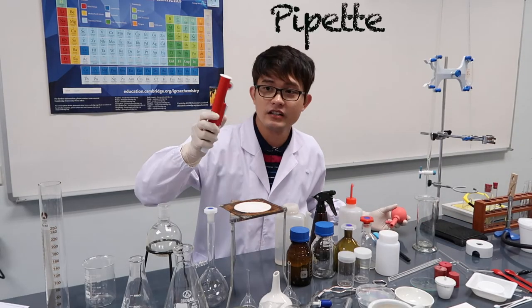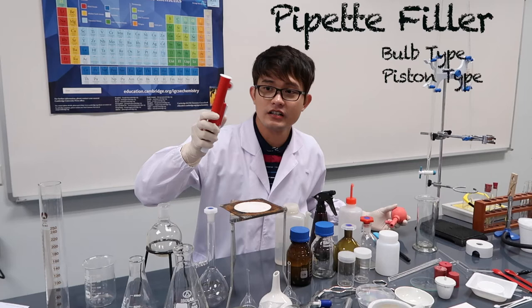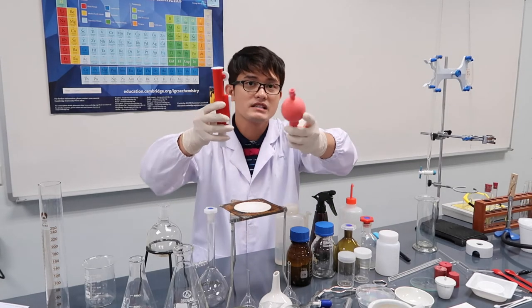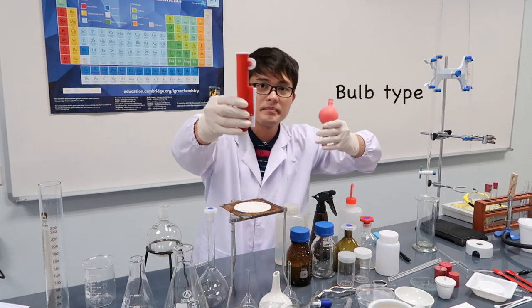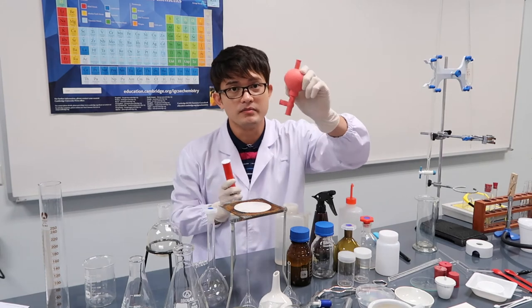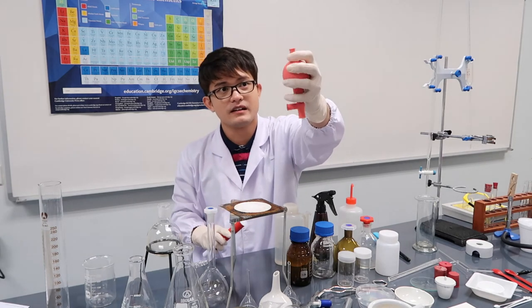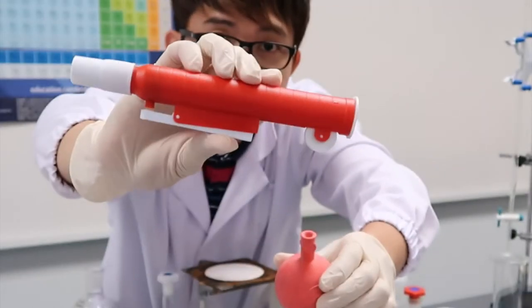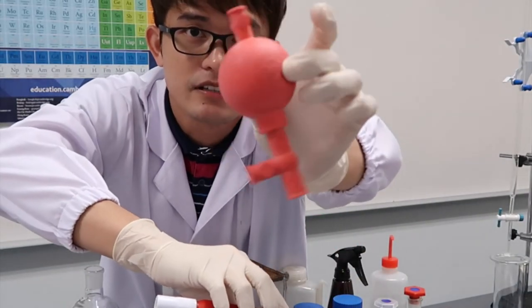This is a pipet filler. There are two kinds: there's a bulb pipet filler and a piston pipet filler. I prefer the bulb type because it's easier to use. Here are both — the piston pipet filler and the bulb pipet filler.